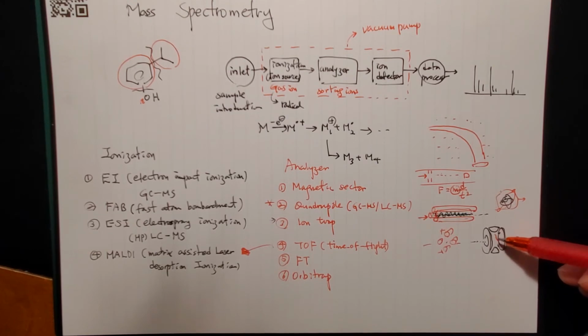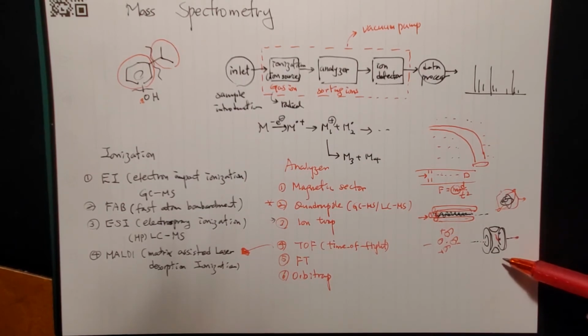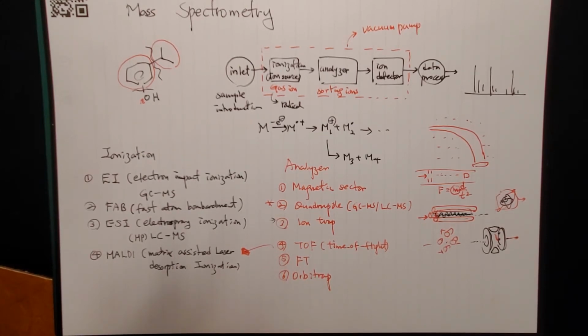Then the idea is you don't have to have them out. You don't need a detector. The detector is actually around here, the trap. So the detector detects the charge oscillation, just like the photon, the light. So the overall oscillation of the charge, the electric field, you can Fourier transform to find out the frequencies that are present there.